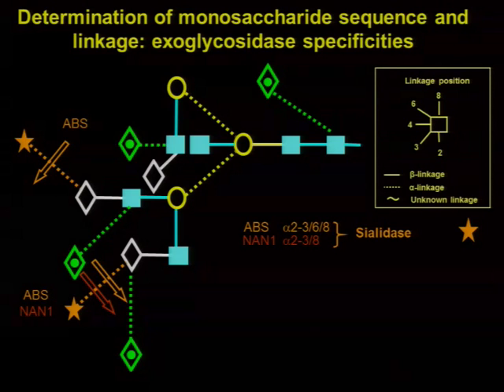So you do have two enzymes that cleave off sialic acid. Now, one of these is able to cleave all the different linkages, 2,3, 2,6, and 2,8. Under the conditions that we use, it will cleave all of those. It's designed to cleave every sialic acid. If you want to know whether you have a 2,3 linked sialic acid or a 2,6 linked, then you need to use this enzyme as well, because this enzyme only takes off 2,3, and if you really persist, it will take off 2,8, which are very rare anyway.